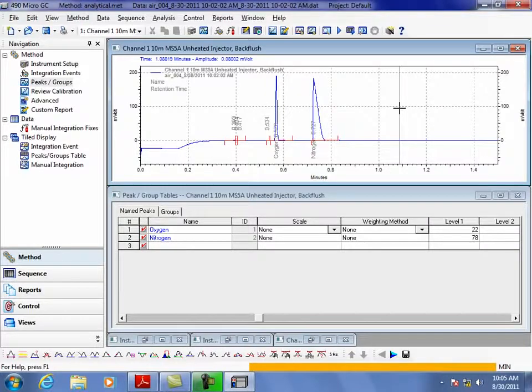Well, in reality, that 1% is real, and anything else that it calculates out here is a guess. It's a valid guess. It's probably a pretty good guess, but it's a guess because you don't know for sure if it's still linear beyond that.